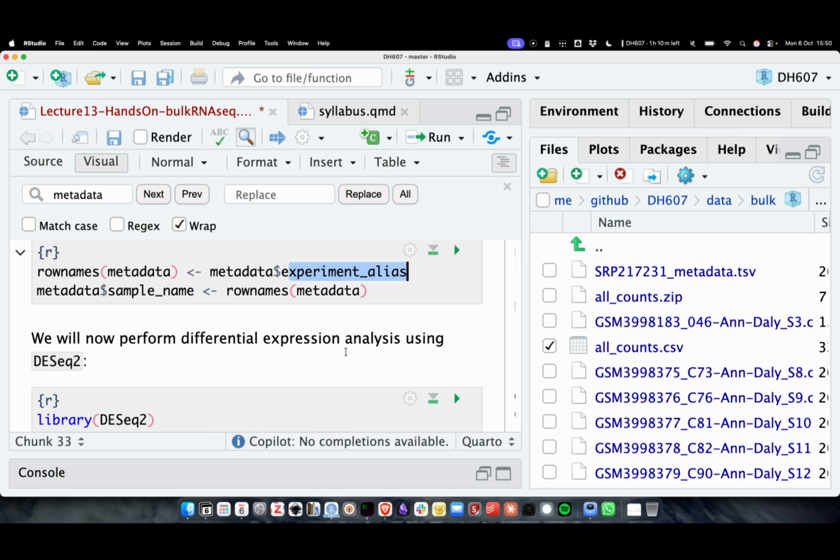What is our goal? Our goal was, how does a different stage of disease impact the gene expression, right? So if the disease stage is control, early and moderate, I want to know what is the difference between, let's say, control and early, or between control and moderate, or between early and moderate. The reason I want the other columns is because I want to adjust for the fact that across these different categories, the age and the sex could be different as well. So we want to account for that overall in the design. Right? That's why we have it.